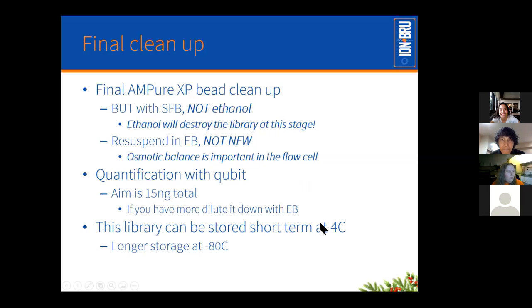So this library can actually be stored short term at 4 degrees C. When I say short term, I mean a few months, maybe 3 months. Longer storage can be done at -80 as well. So if you do end up with loads and you dilute it down, you could then just store the rest at -80 in case you want to do more sequencing later for whatever reason. It's quite handy to still have that around.